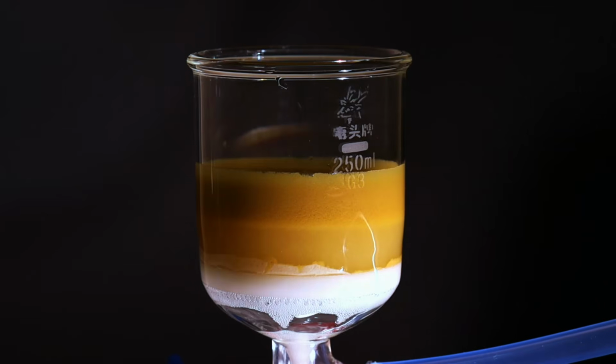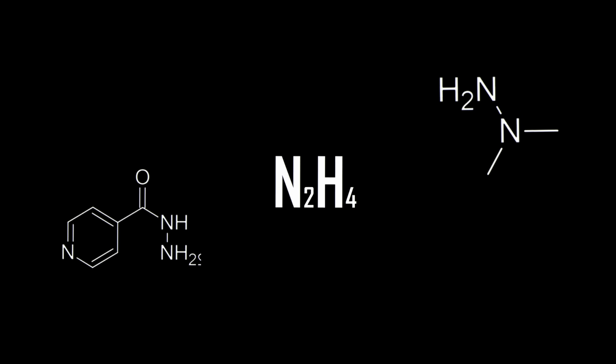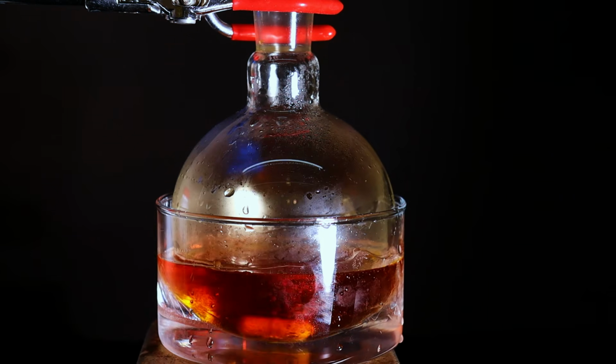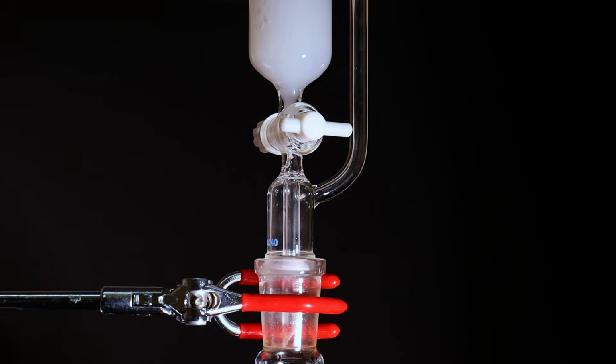You have probably heard of hydrazine before. You know, the extremely toxic and reactive substance that is used as a rocket fuel. It turns out that it, along with its numerous organic derivatives, are incredibly useful and indispensable in many chemical reactions and processes. And one good example is also the star of today's video, where we will be synthesizing it. I am talking about this molecule, phenylhydrazine.